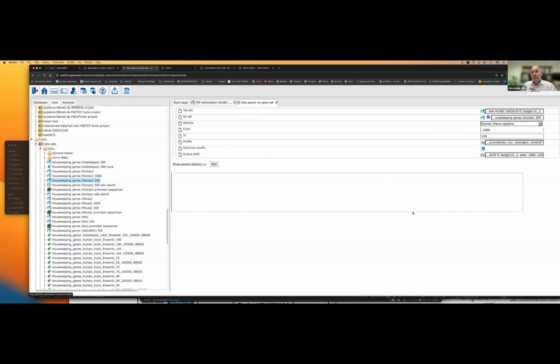You may now start blaming, saying you are wrong. Those housekeeping genes are also changing in many conditions, and you are always true. But still, this set of 300 genes is published in one good paper where they scan many different conditions, and they really found this set of genes which are almost always kind of stable. So that's a good set to compare.